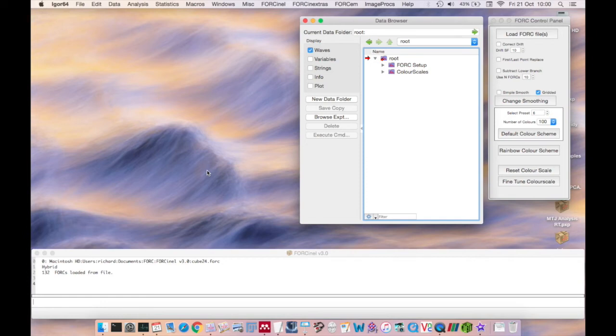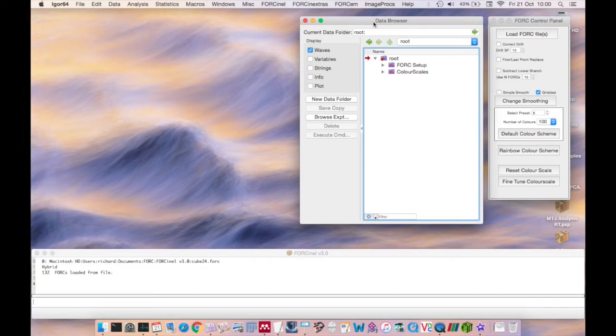Hello and welcome to the second of a series of video tutorials exploring the new features of ForkNL3. My name is Richard Harrison, author of ForkNL, and in this video I'll be guiding you through the basic process of loading, pre-treating and processing a single fork diagram.